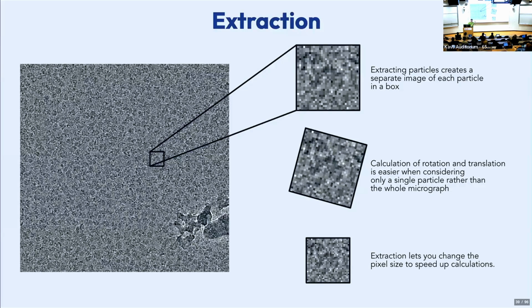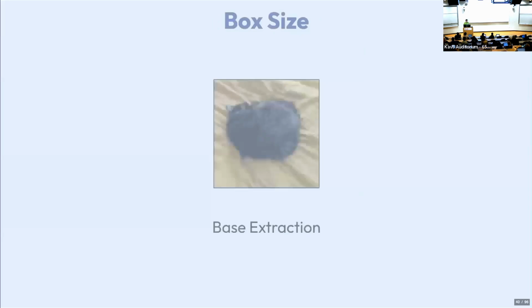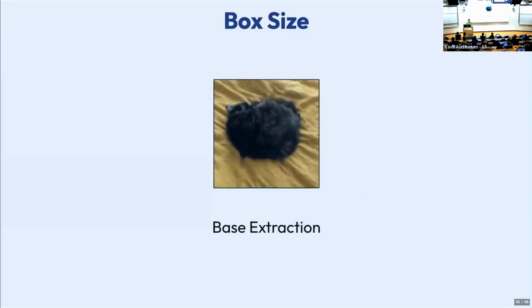Okay, so this brings us to the next important decision point when you're processing your data, which is: how big should my box be? We got some questions about that with CTF already. There's some other considerations too. So to answer these questions, let's all look at a picture of my cat.